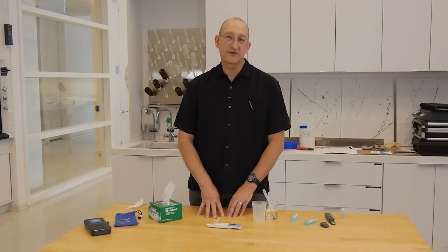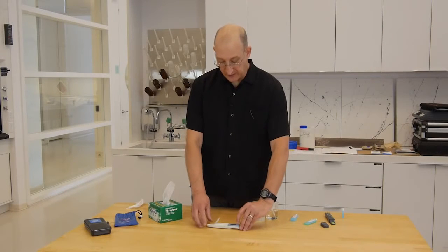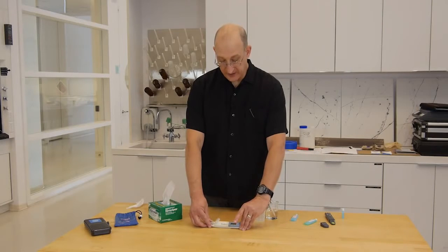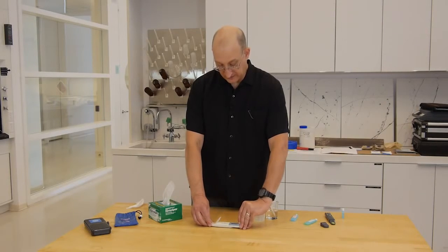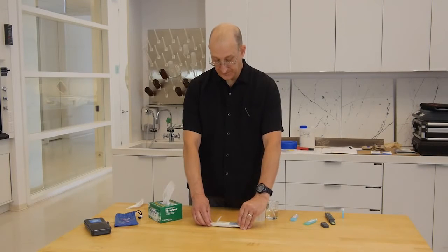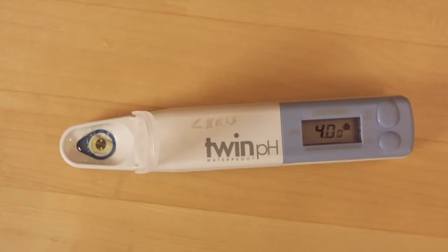Again, we wait for the happy face. We have our happy face, so we push the calibrate button. Initially, it wants to calibrate to pH 7. We don't want that. We push again, and we're now calibrating to pH 4. If we were calibrating to 10, we would push one more time, and we would get the calibration for 10.